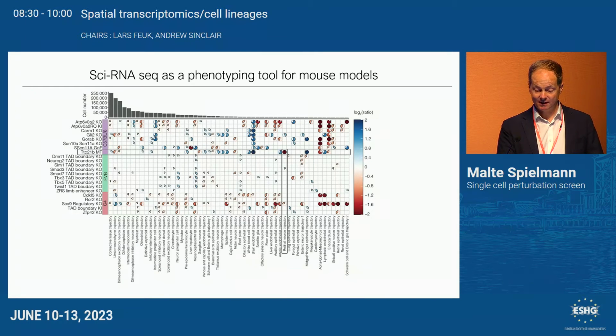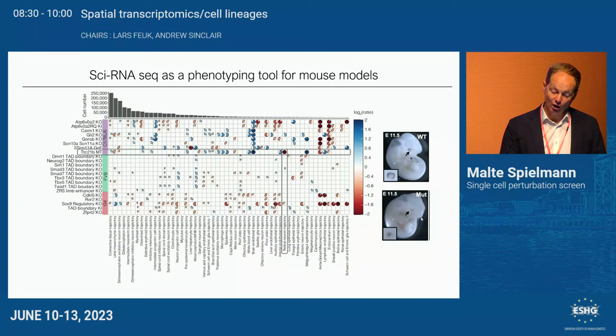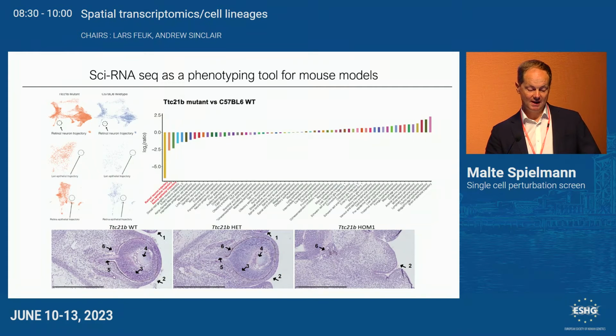So we looked inside. We actually did conventional phenotyping. And just by looking at the mouse, we could already see this is a wild-type mouse, and this is the mutant, and there seemed to be something wrong. But when we then did histology with some help, oh no, we actually zoomed in further, sorry. So this is the cool thing about the bioinformatic approaches. We don't have to kill them, but we can do all this in silico. So we checked out what other cell types are missing. And then here, this is the gain cell types in the mutant, and this is the lost. And if you take a look down here, this is retina, this is the lens, and also retinal epithelium. So it seems that there are several structures missing in this mouse. And when we then just did H&E staining, you see here, this is the wild-type eye, this is the heterozygous, and then the mutant, it's severely malformed. And there's still some cells around that are difficult to see here.